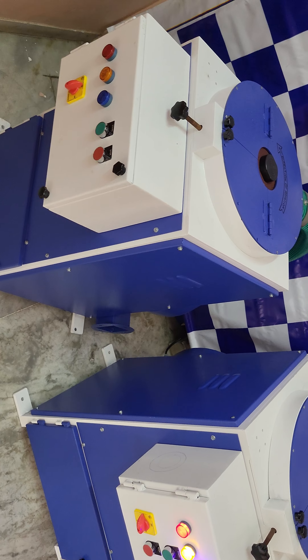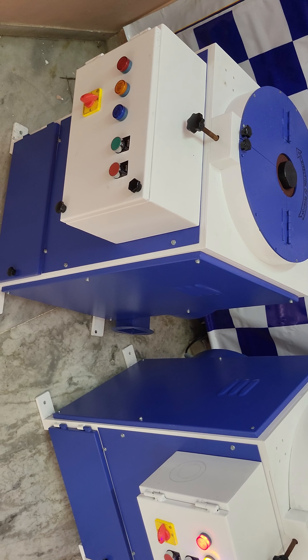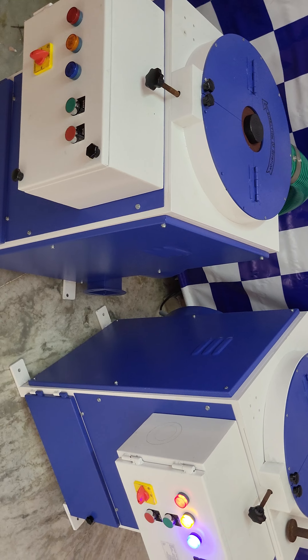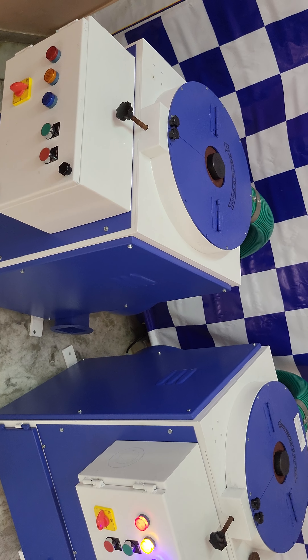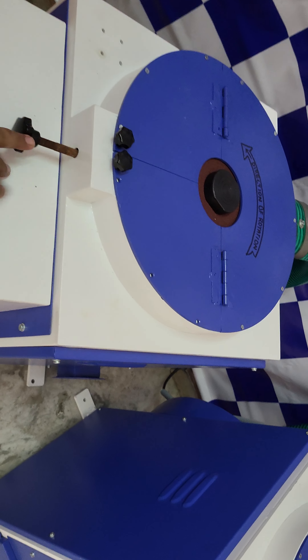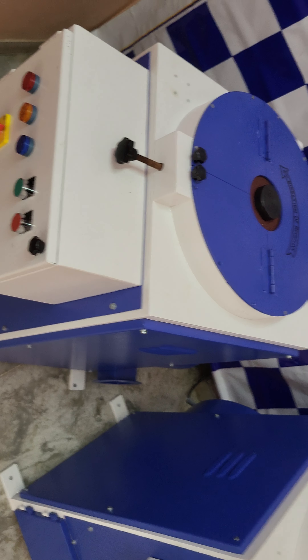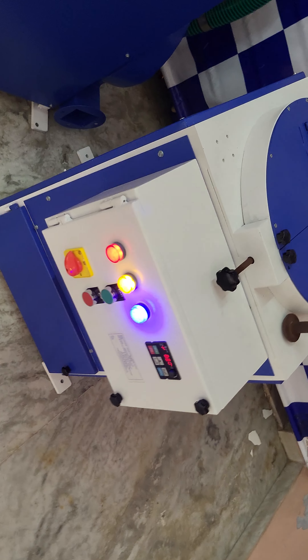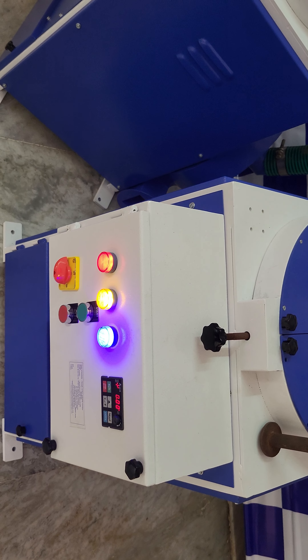In both machines the suction motor is a 3000 RPM fixed speed, 1 HP, 3-phase motor. For the main operating dish motor, the fixed speed machine has a 3000 RPM, 2 HP, 3-phase motor.